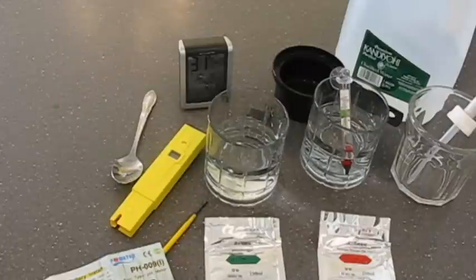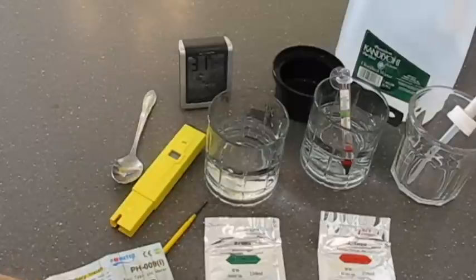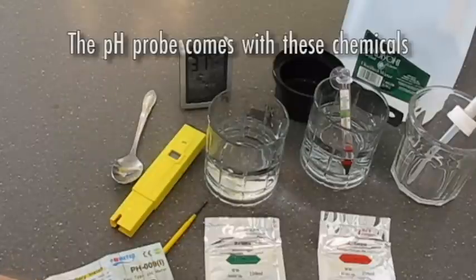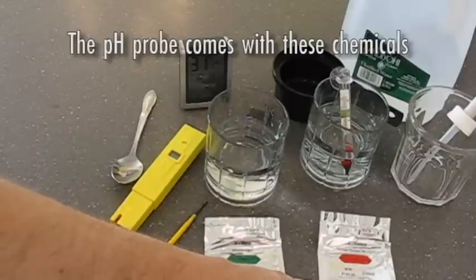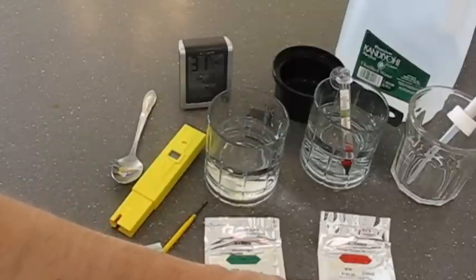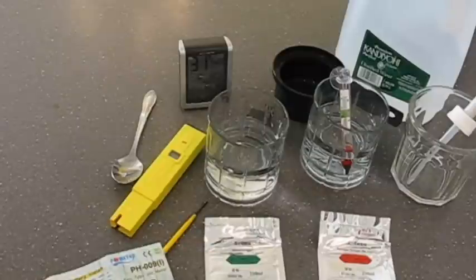This basically comes with some phosphate that when mixed with distilled water will read at 6.86 pH and some potassium hydrogen phthalate, if I'm saying that correctly, which will mix at a pH level of 4.0.